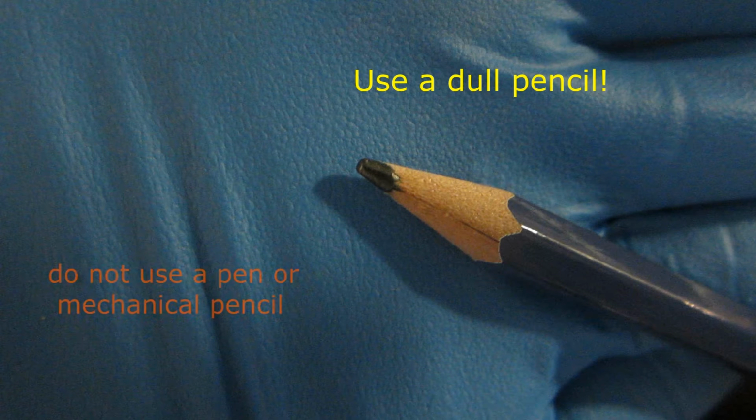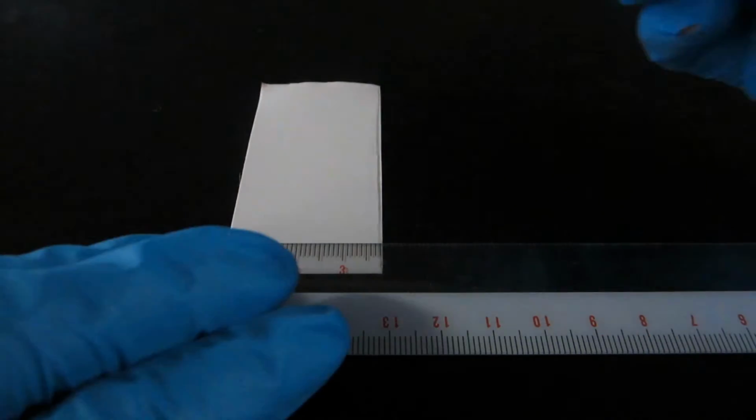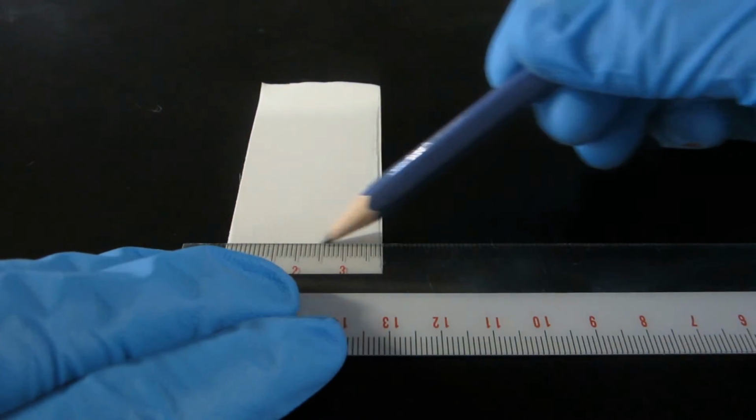Do not use a sharp pencil or a mechanical pencil, as this will score the silica gel and ruin the plate. Pens also cannot be used as the ink contains organic molecules that will run up the plate. With a pencil, softly draw a line about 1 centimeter from the bottom of the plate. This first line will serve as the origin, which is the starting position of the samples.